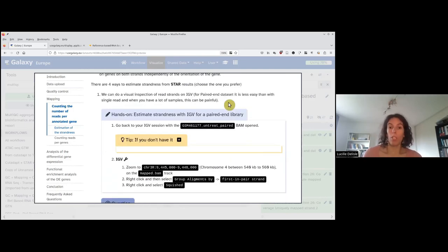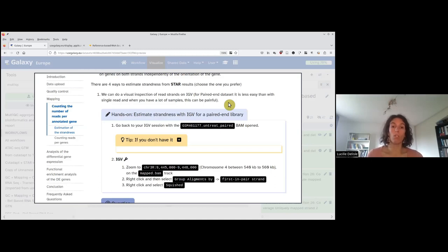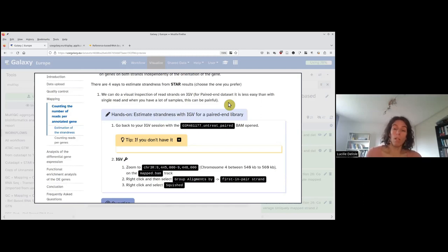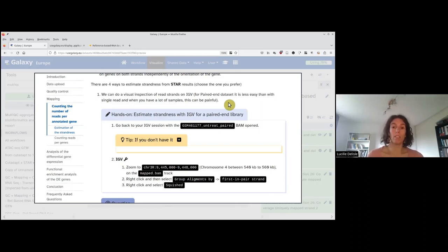Usually you can obtain strandness information either from the sequencing facility if you generated the data, or from the paper's methods section or GEO description for public data. Unfortunately, sometimes you cannot find this information, and you need to determine the strandness from the data itself. There are four ways to estimate the strandness from the results, and I will go through all four approaches, although in a regular analysis you don't need to do all four.